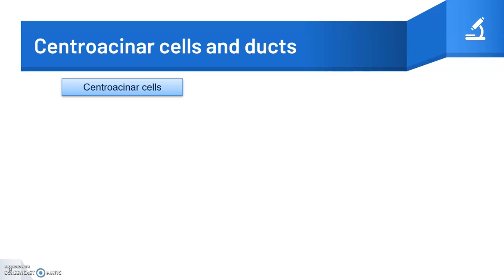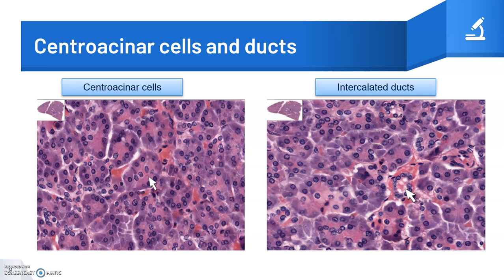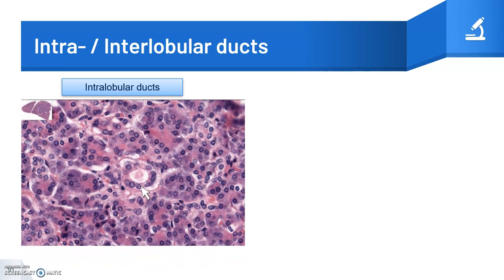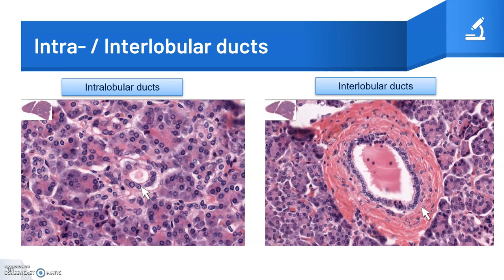Centroacinar cells are duct cells located within an acinus. Ducts start within an acinus and lead into short intercalated ducts with a simple cuboidal epithelium. Intralobular ducts are small ducts present within pancreatic lobules and drain into interlobular ducts. Interlobular ducts are larger ducts with simple columnar, stratified columnar, or stratified cuboidal epithelium supported by a thick layer of connective tissue.